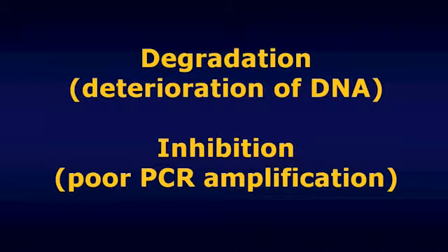When that happens, when DNA molecules get damaged, they can't be amplified through that PCR amplification process, and they can't contribute to the electropherograms, or at least not as much as they could have before that damage or deterioration had occurred. Right? So degradation gives rise to peak heights on electropherograms that are smaller than they would have been if the material had not been degraded.